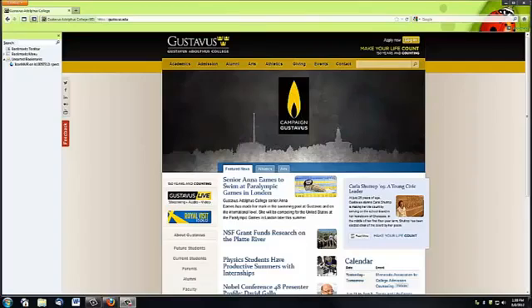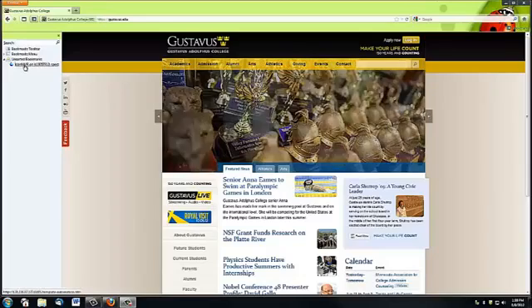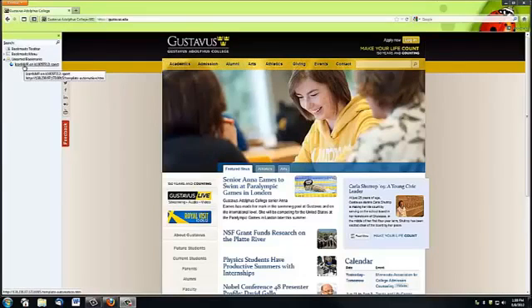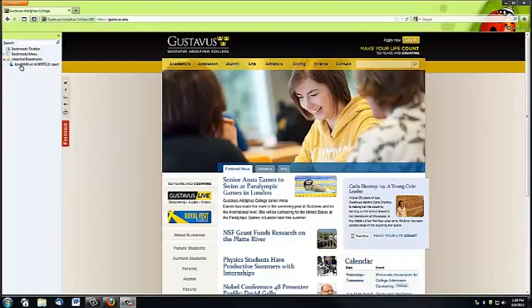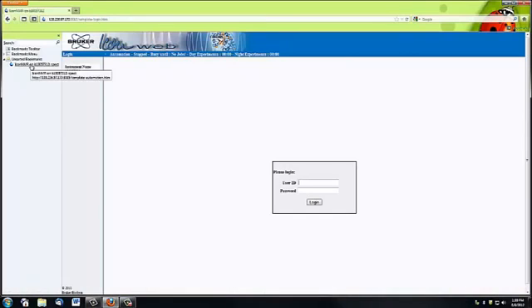This video will demonstrate how to queue an experiment using IconNMR. To access the web interface of IconNMR, you'll need to visit the website that's been provided by your instructor. We recommend that you bookmark this website because you'll be using it a lot.